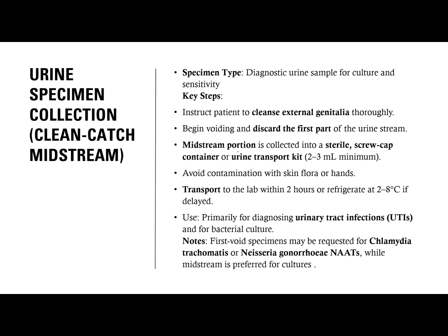Ano yung mga guidelines? Let's start with urine sample collection. Now, when the patient collects urine sample, the ideal sample is always the midstream clean catch. Now, you would collect some urine sample, class, for culture and sensitivity.